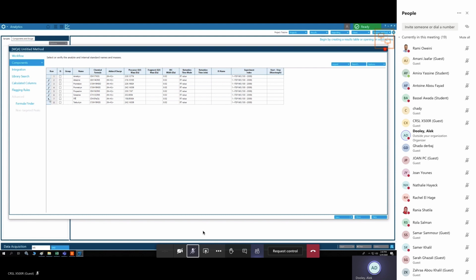All right, so I'm going to delete that row. Now I have my extra row below. Okay, strange. All right, so yes, good question. Any other questions from this chart?